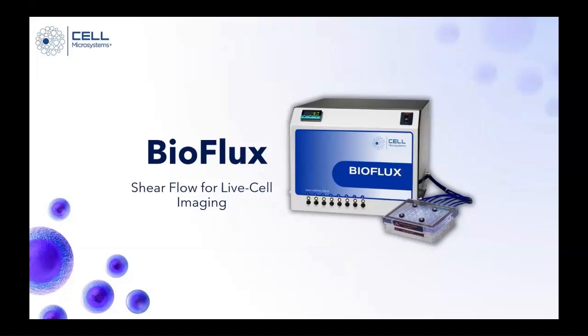And then if we think about the microbiology space and specifically biofilms, there are certain species that develop the biofilm under flow conditions as well. So again, it depends on really the question of the experiment and the experimental design.